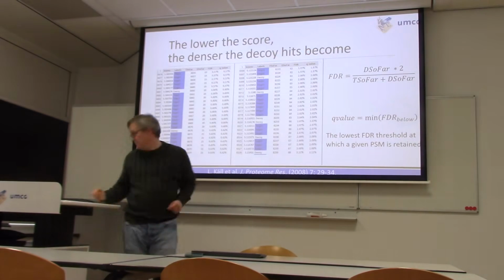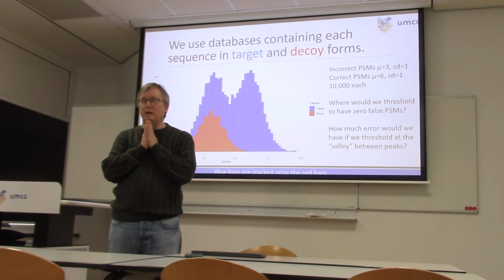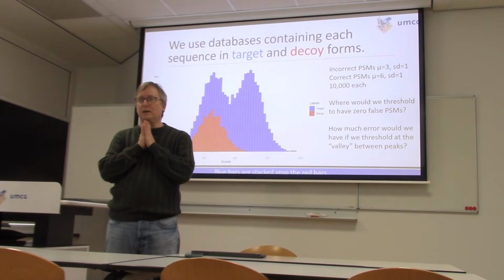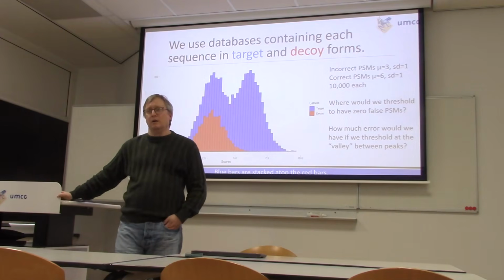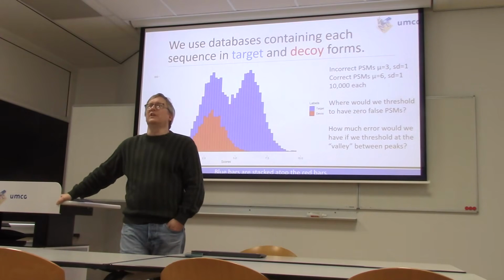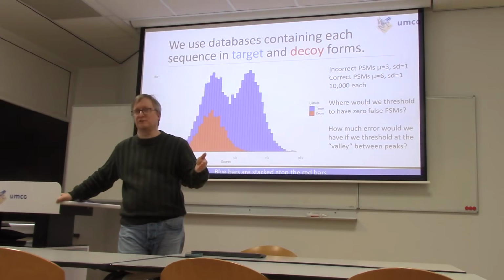Okay, yes, I have a question still. I don't fully understand: when you reverse the sequence, and that sequence is overlapping, so it's the same as the normal non-reversed sequence, then it gets the decoy label? The protein sequence for a real protein is given in reverse order, C terminus first, all the way to the N terminus.